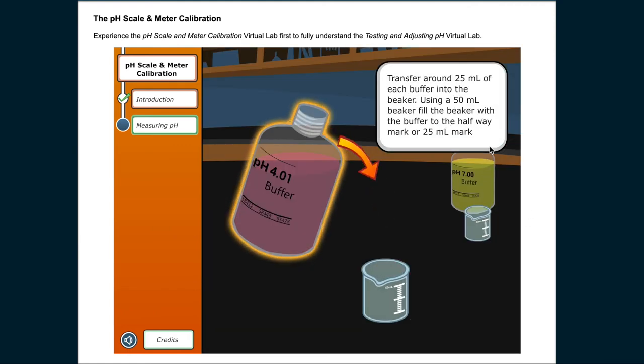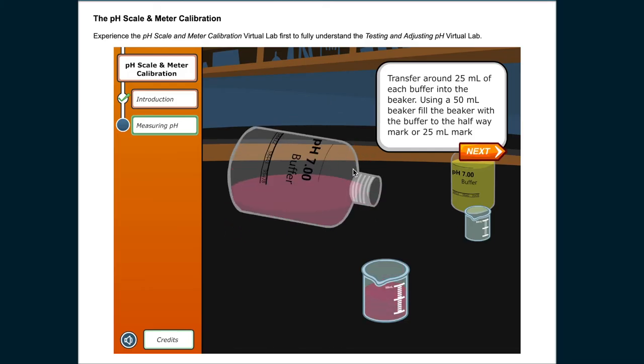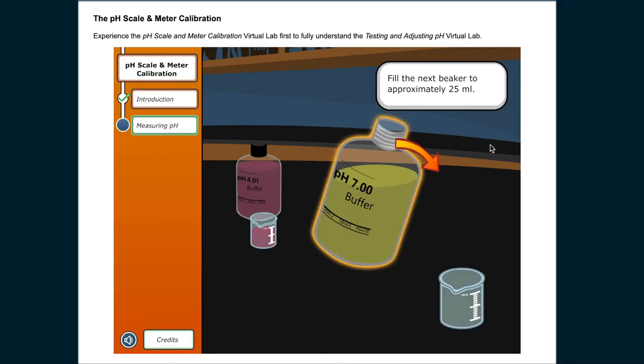Transfer around 25 milliliters of each buffer into the beaker. Using a 50 milliliter beaker, fill the beaker with the buffer to the halfway mark or 25 milliliter mark. Fill the next beaker to approximately 25 milliliters.